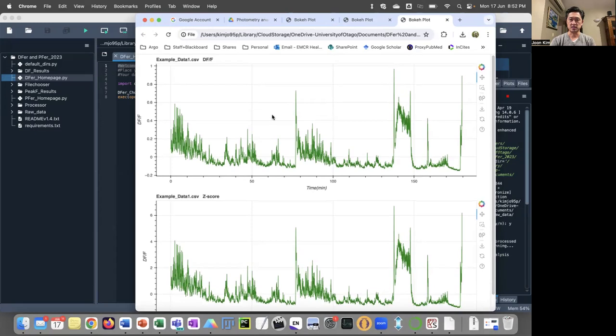What we're actually seeing is some hypothalamic CRH neurons. The animal has just been plugged in, so the activity is a bit high. The animal settled down. We have a short stress here, and then another stress here. And then at the end is the mouse being picked up to be sent back home, and that generates another peak, which we use as a normalization signal.